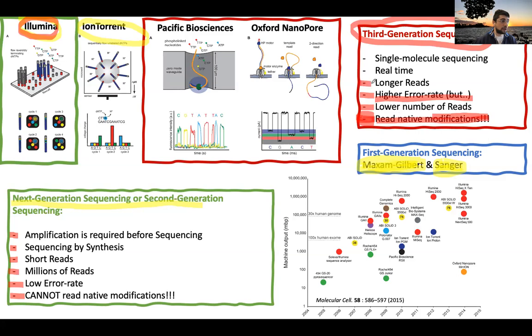The reads are usually longer. We're talking about kilobases, and also megabases have been reported. So one single molecule can be read as 1 megabase or even longer. And again, I told you, you can sequence a single molecule, okay? So the signal that it's giving you is coming from one single molecule and it's real time, okay?